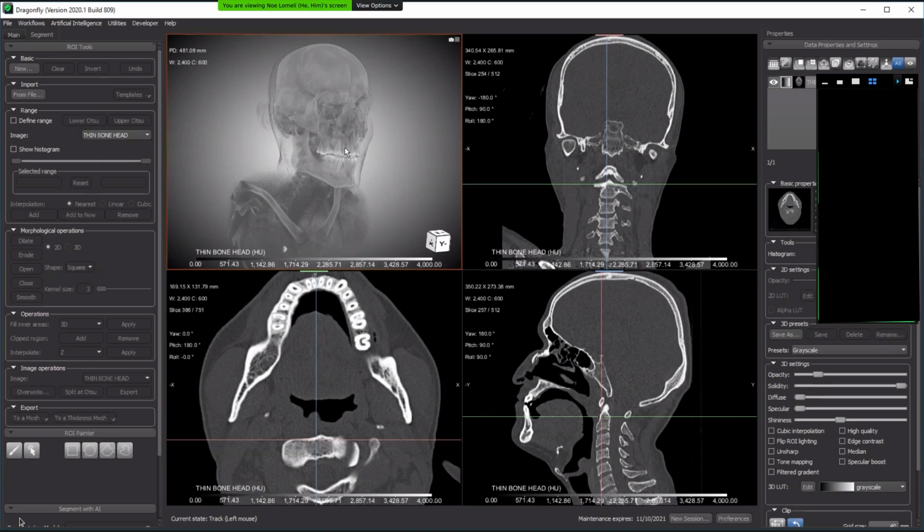Okay. So you're particularly interested in the maxilla, not the mandible? Yes, for this research that I'm conducting now, I'm just interested in the maxilla. Okay. So what we could do is to segment probably all the bones in the beginning as a first step. In the second step, we could separate them, to extract the maxilla as one region of interest. And for the cavity, you probably have the same question. The cavity may be segmented as one volume of interest first. Then you probably need to separate them into different cavities.